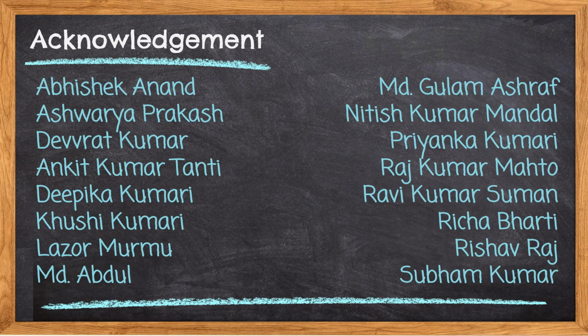Near about 31.4. You write down 31.4, and you repeat this experiment twice or four times, and then start the calculation. And you see this type of reading may come, and in the calculation we will calculate the different compositions of NaOH and Na2CO3 limits.